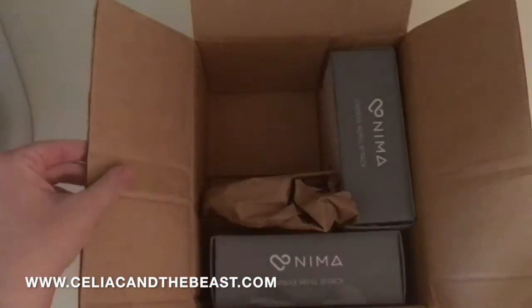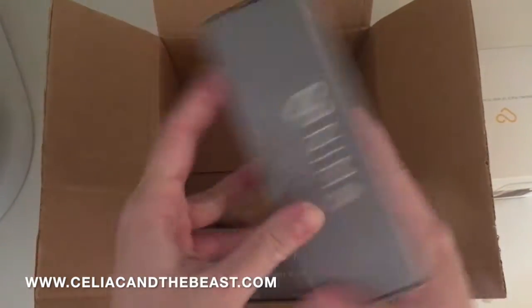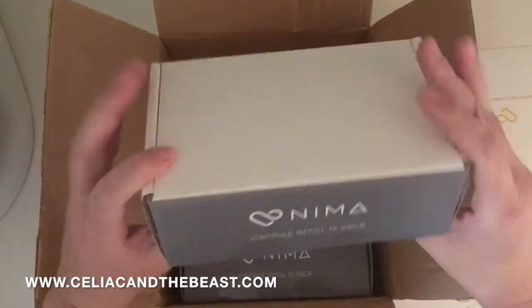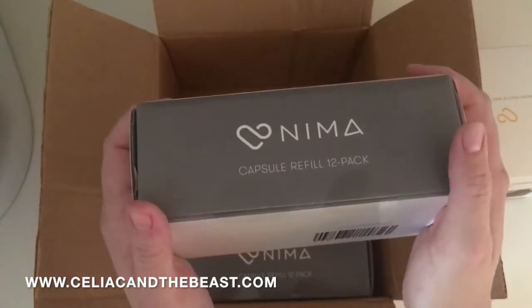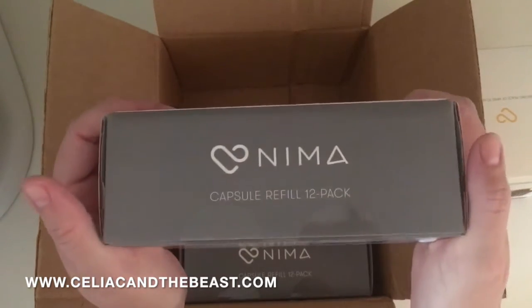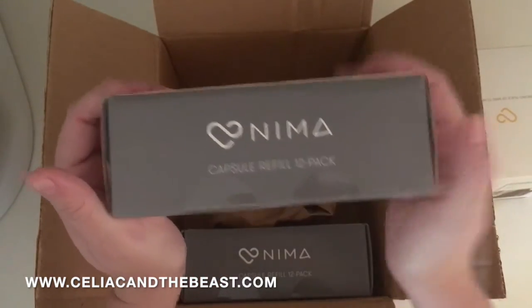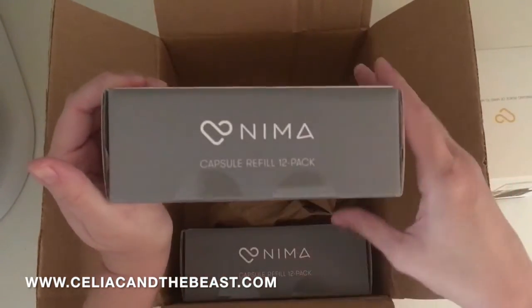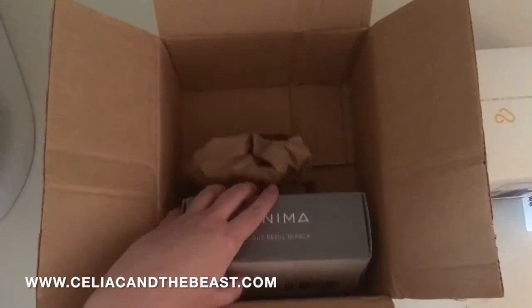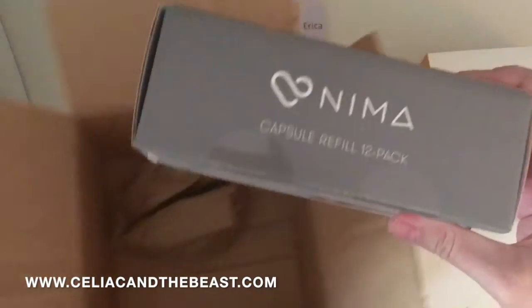Let's put this aside to make sure we have everything out of the box. Okay, these are the capsule refill packs — this is going to be a 12-pack. It depends on how often you're testing; you could use one a day or one a week, depending on whether you go out to dinner. Like me, when I travel I want to make sure I'm dining out safely, so I may take one of these with me when I travel. It's a sturdy little pack. And since I ordered two because I travel so much, let's open another one.